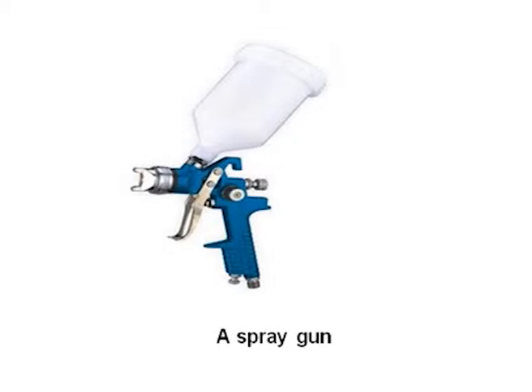The working solution is prepared by dissolving 6 ml of solution A and 0.5 grams of sodium perborate in 120 milliliters of the solution B. The surface is impinged 2 to 3 times with the working solution from a distance of about 6 inches using a spray gun, one variety of which is shown on your screen. On drying it at room temperature, the finger marks are rendered visible.